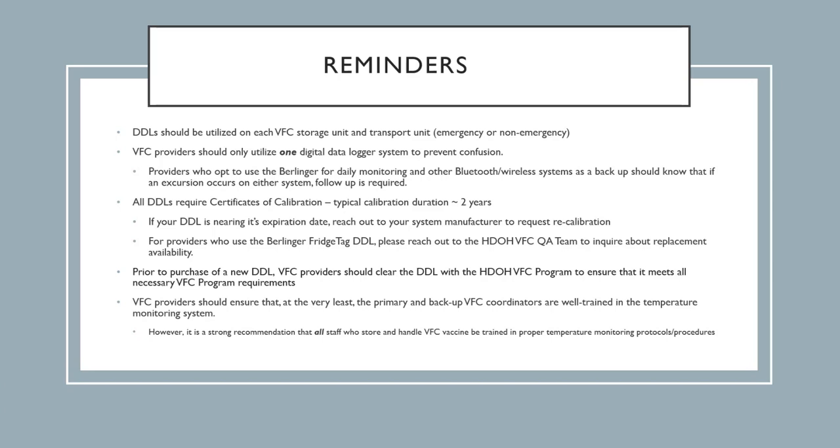Providers should ensure that at the very least, the primary and backup VFC coordinators are well trained in the temperature monitoring system that you've chosen. However, it is our strongest recommendation that all the staff who store and handle VFC vaccines should be trained in proper temperature monitoring protocols or procedures applicable to your facility.